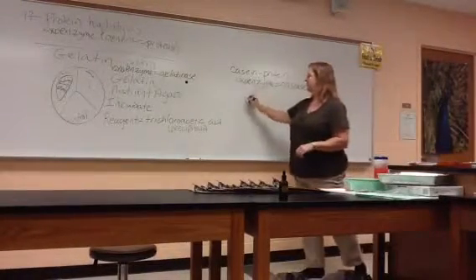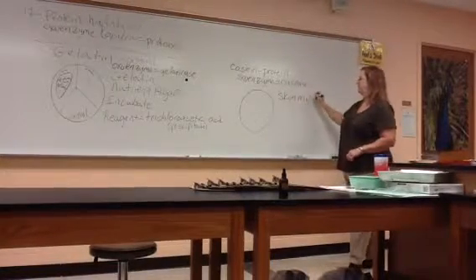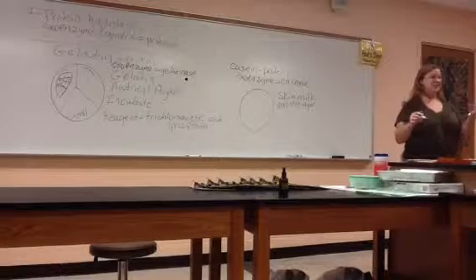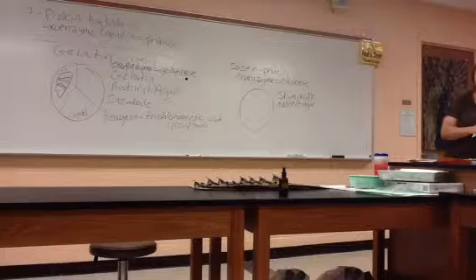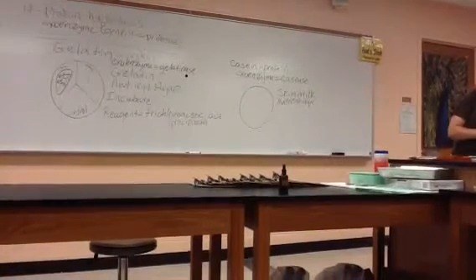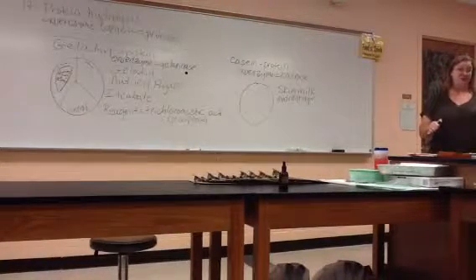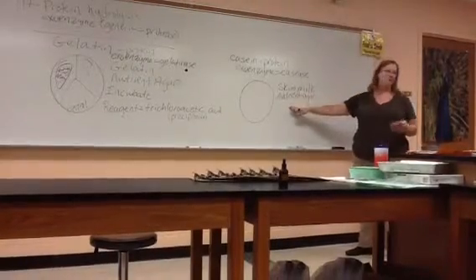So that agar that I just held up that has casein in it is called skim milk nutrient agar. It's funny, skim milk. You think it's funny, you should try and make it. That powdered milk that you can buy in the grocery store, you mix it with agar and heat it up. It almost always gets coagulated in the autoclave at high heat. It's not a fun one to make. It smells, but it's already made for you. You don't have to do that. Skim milk nutrient agar, again, I'm a stickler for the name, make sure you get all 4 words there. So there's already casein in with the agar.